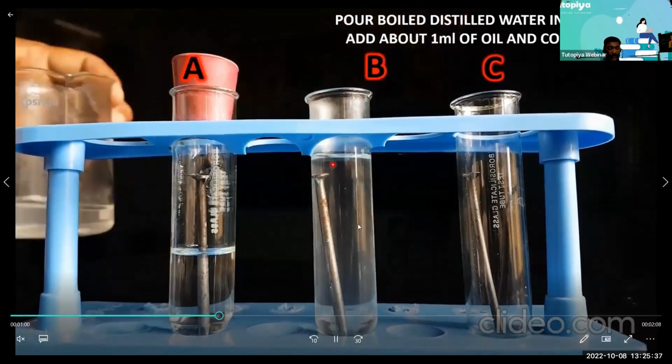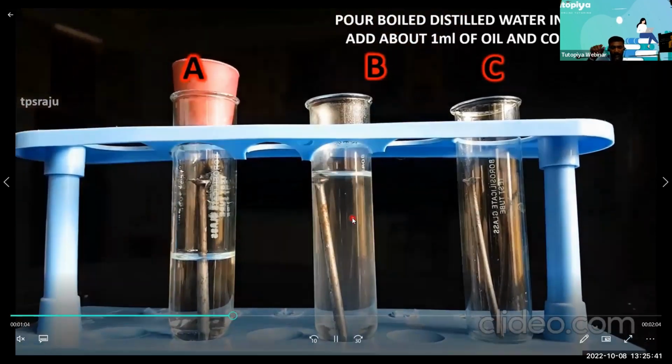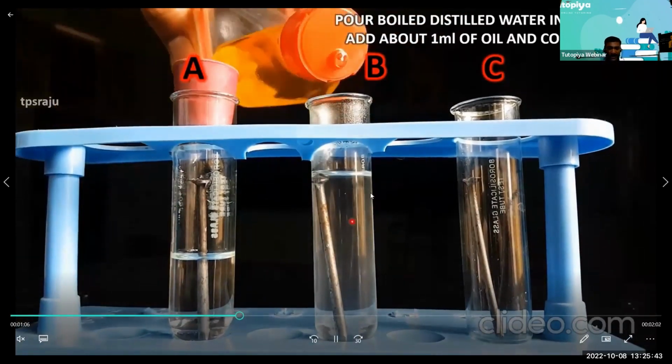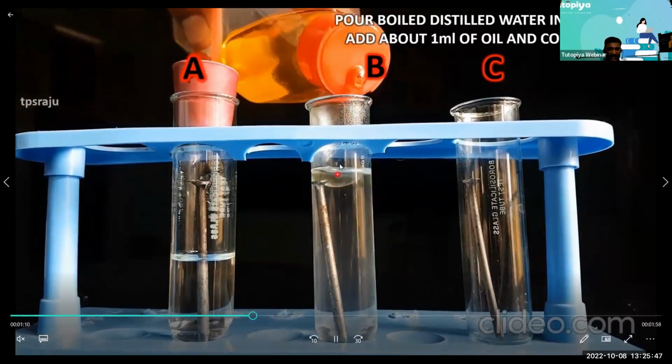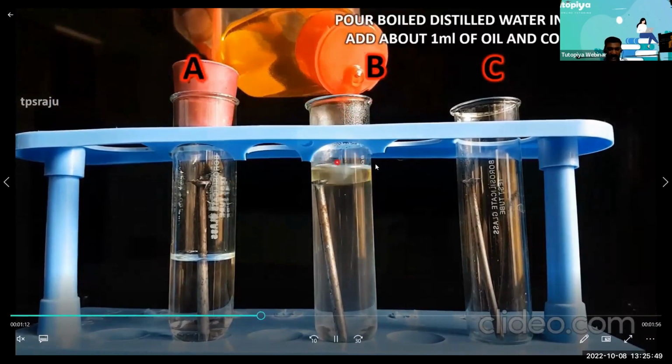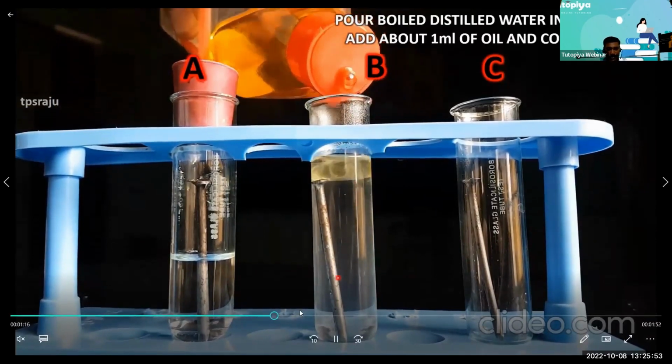completely immersed, because the boiled water is free of oxygen, no dissolved oxygen. We say DO, dissolved oxygen is absent. And I slowly pour some oil, so that the oil, it has less density than water. It floats on the top as a layer, blocking the entry of any oxygen. So there is no oxygen, only water here.